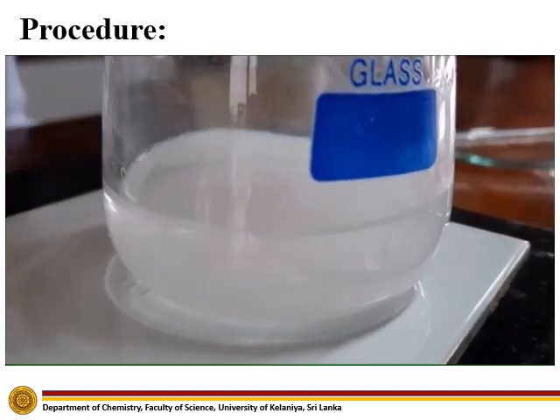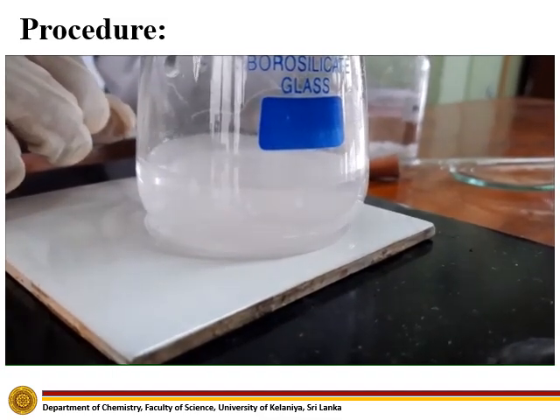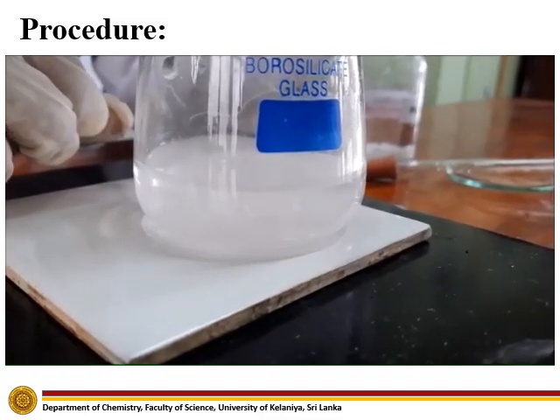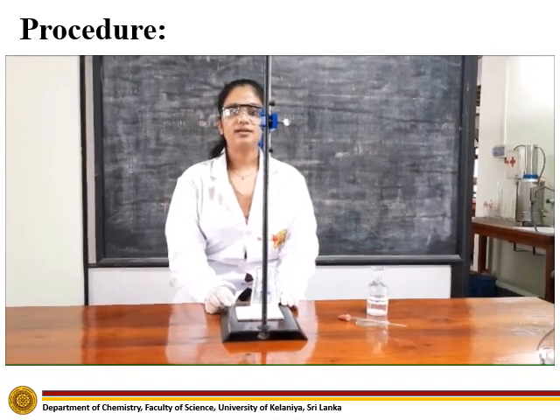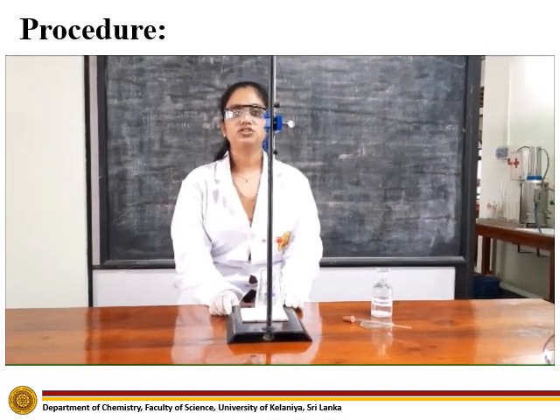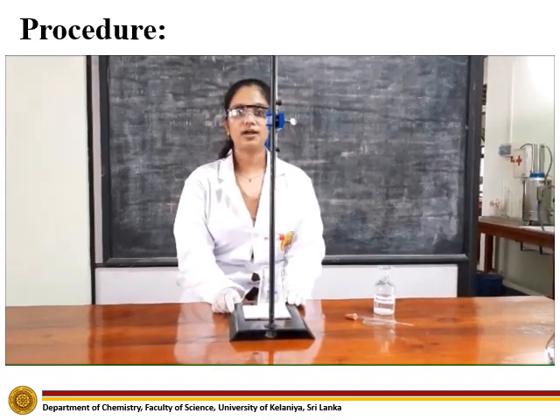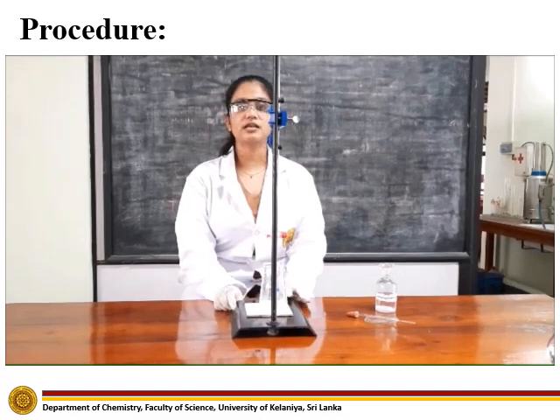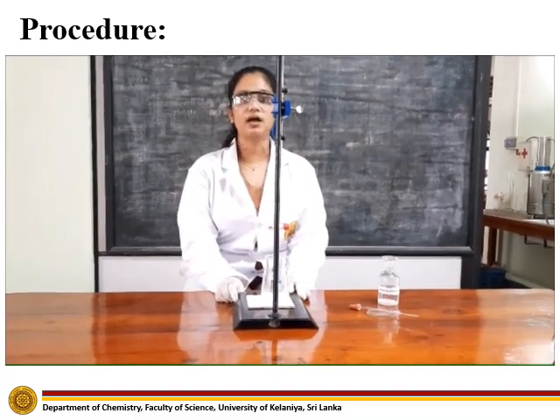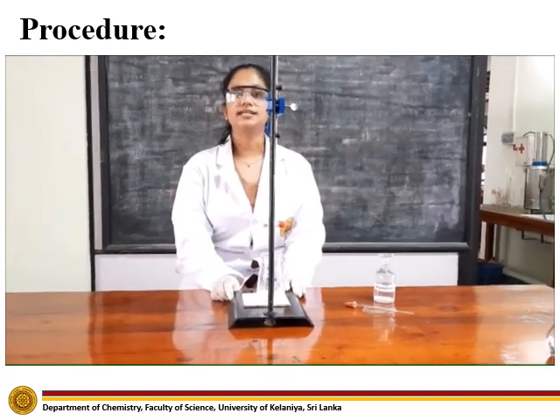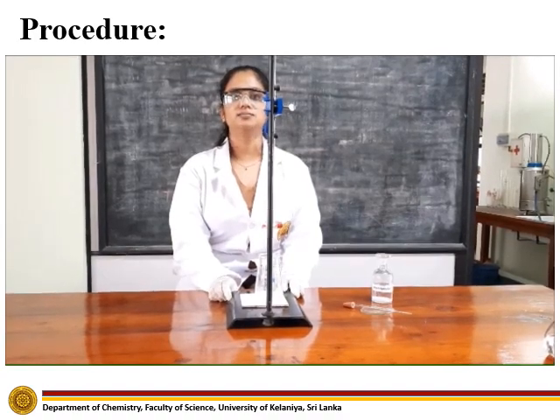This is the end point of the titration. Now let's titrate 25 ml of saturated calcium hydroxide solution prepared from 0.05M sodium hydroxide solution against HCl to obtain burette readings.